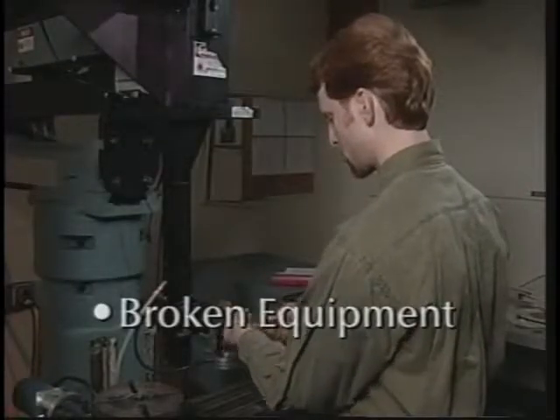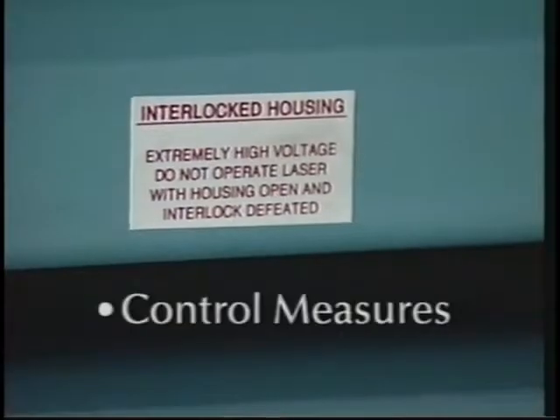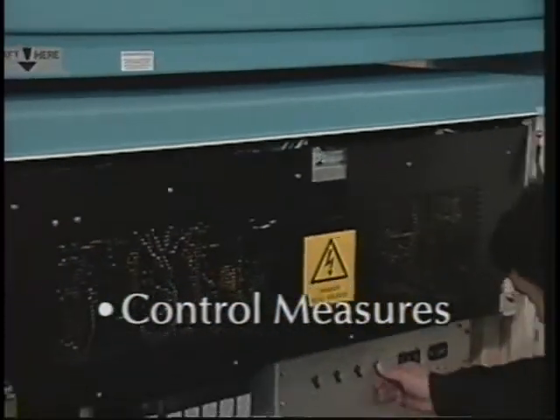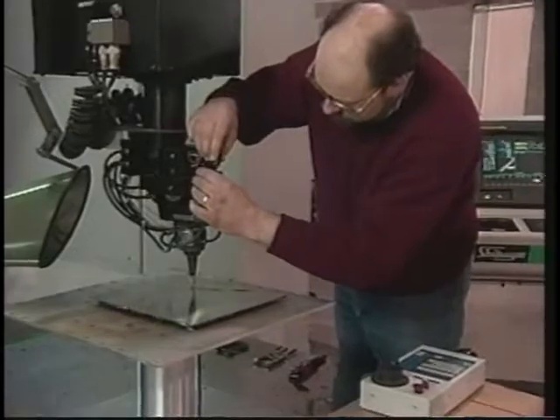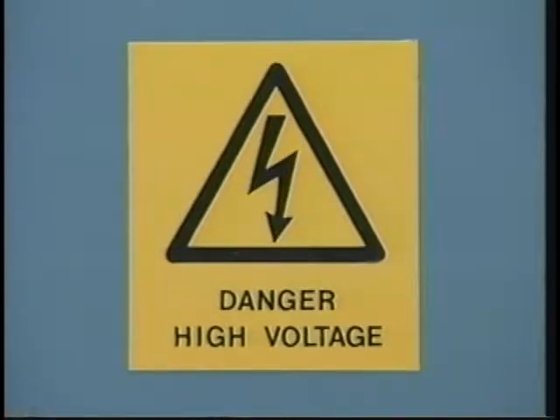Over a period of time, system components may break or suffer damage. Labels may be removed or worn off. Emission indicators may burn out. Protective housings may be damaged. Parts from a system may be borrowed and not returned. Routinely check the laser system to make sure that components work properly, no parts have been removed, and that all warning labels are in place and the print is legible. Perform routine maintenance.